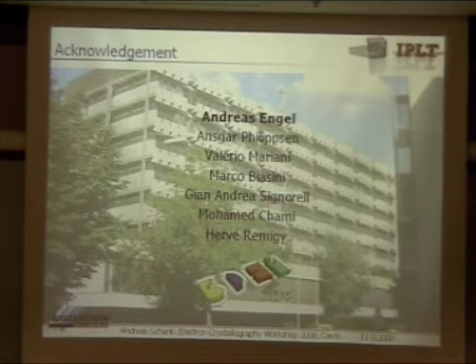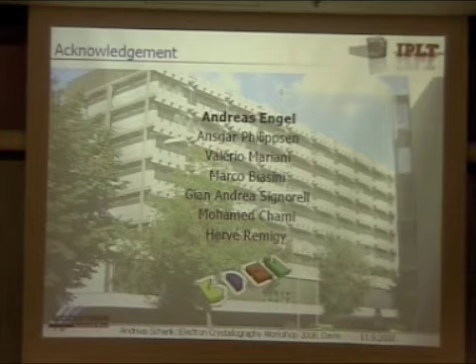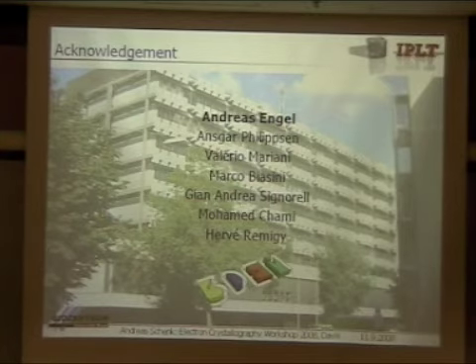One important question. Is there any merit, particularly in the unbent untilted samples, in picking out the individual single particle images using the cross correlation peaks, classifying the images, and then trying to determine what tilt angle those various classes have, so that you could put the tilt angles back in to do the correction later?